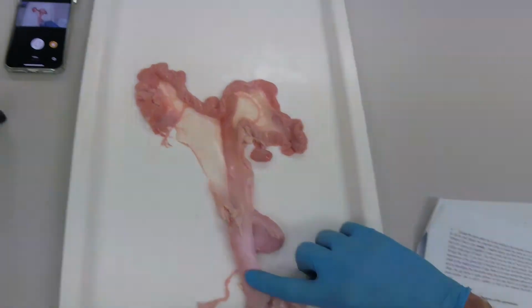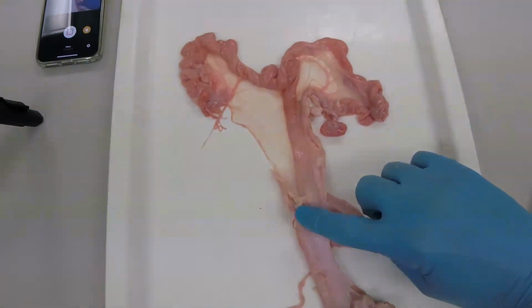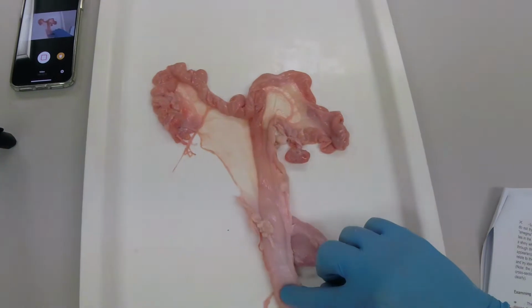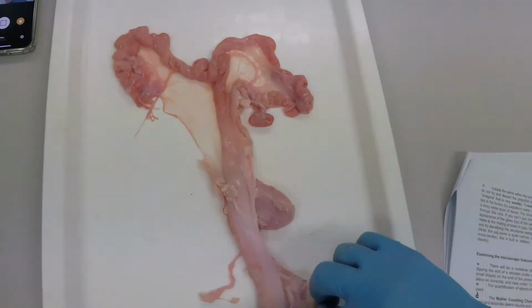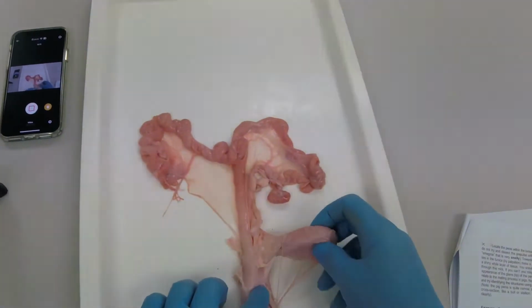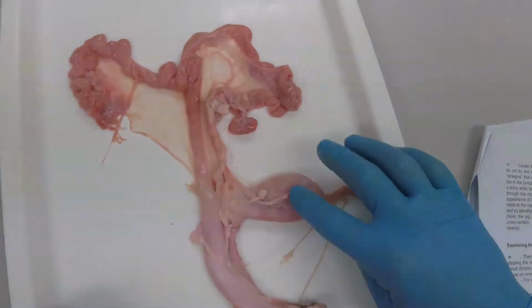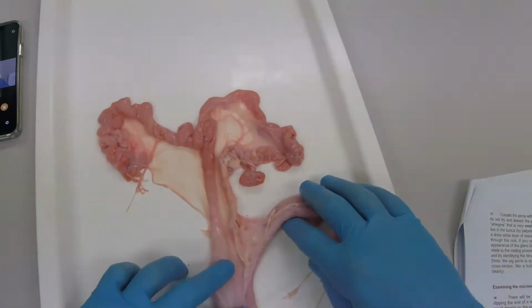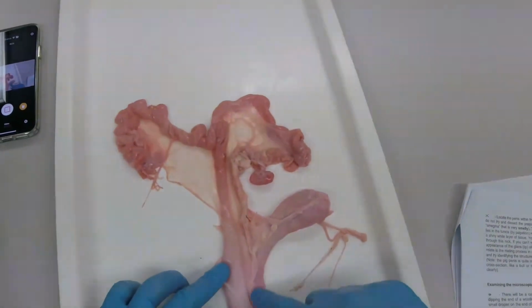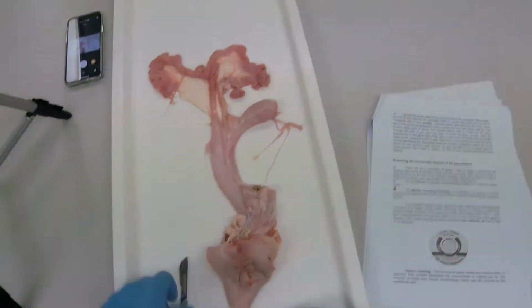Okay, so just change to the head cam now, and you can see I'm feeling along the vagina and the start of the uterine body, feeling for the cervix region. So the cervix is quite hard, a cartilaginous material in rings, which forms a physical and biochemical barrier for foreign objects wanting to gain entry into the female tract. And there I'm just pointing at the bladder, which is connected by a common opening into the vagina by the urethra from the bladder.